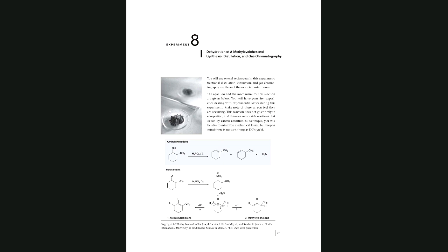So I have to get everything ready before I add my chemicals because I don't want to get the chemicals in here and leave it open. If I do that, the reaction can take place, and when the reaction takes place, the product is going to escape.